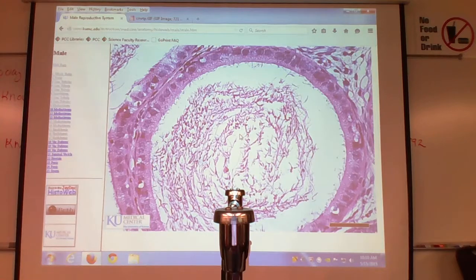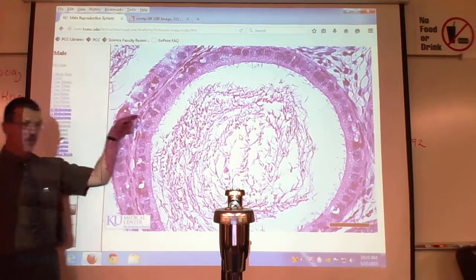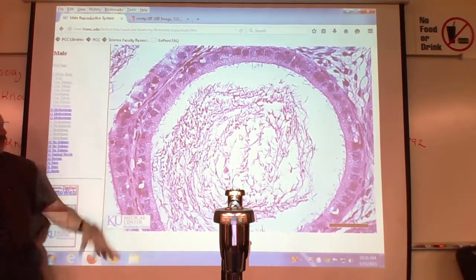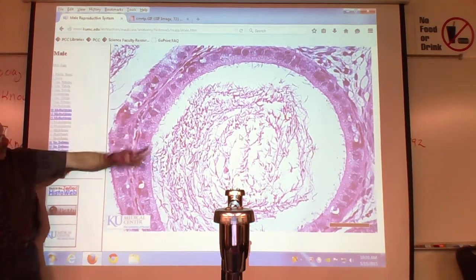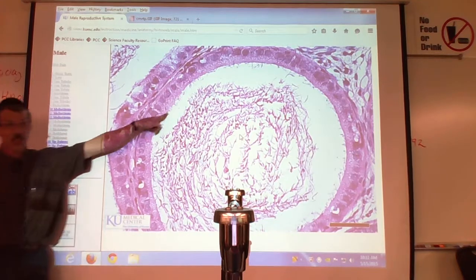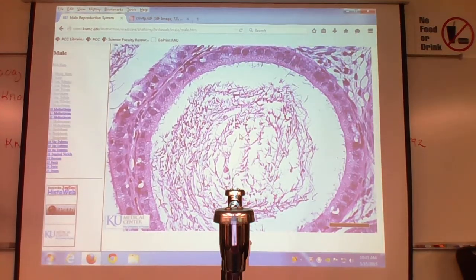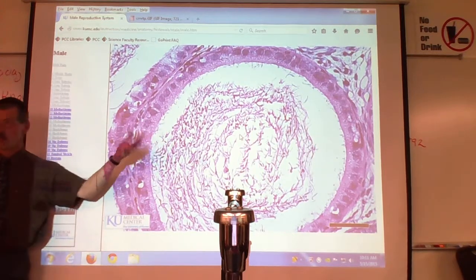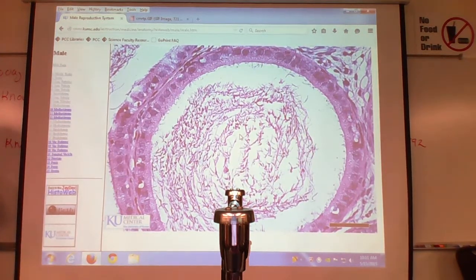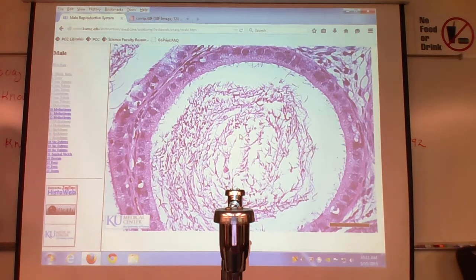Here's a close-up of one of the rings in an epididymis. So, the trick is, a much smaller number of cells for a much bigger lumen. These are the sperm all learning to swim. Right? So you're going to focus on this edge here. Hairs. What tissue had hairs? PCC. This is pseudostratified columnar epithelium. Those are called microvilli or stereocilia. Sounds like your ear, right? But that's basically hair-like cells on the outside with the sperm on the inside. That's to kind of kick them around and keep them moving. Right? So those are the stereocilia on top of the PCC? Yes.